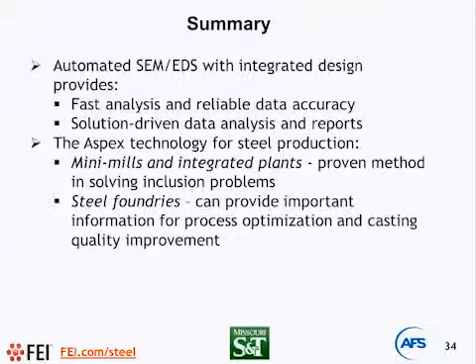All right, we have one more question. Do you see this as useful in a ductile iron foundry? Oh, good question, because I am a ductile iron guy. We used automated inclusion analysis for several different directions for ductile iron.